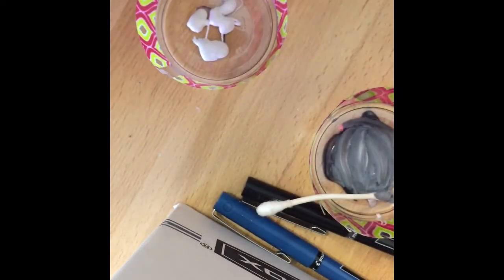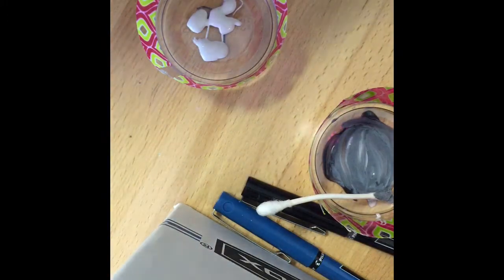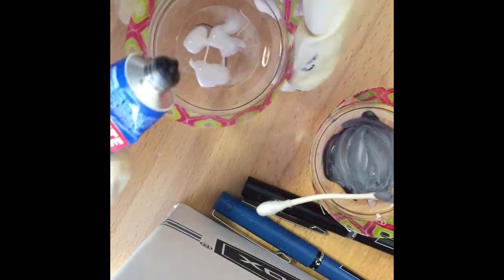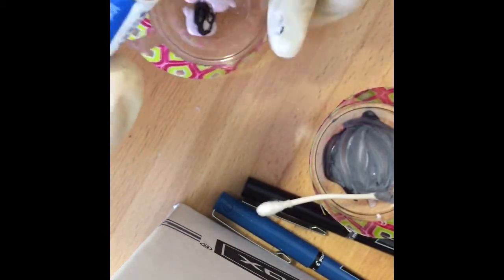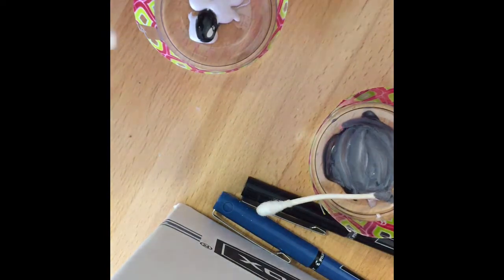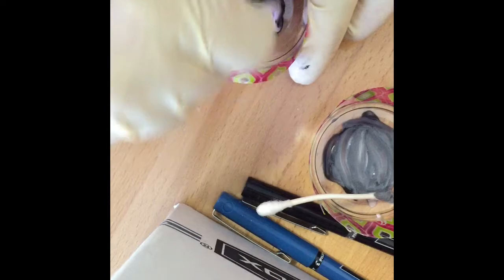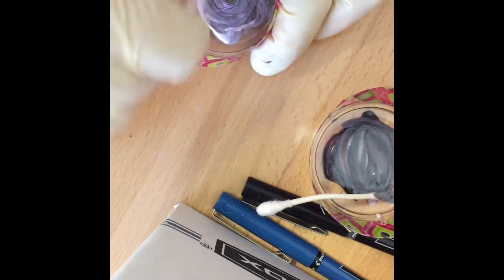Now, I'm not exactly showing the instructions, but the instructions do say you want to try and get whatever you can mixed within 5 minutes, because it starts setting after that. So I'm going to take one little. Sorry to put that little extra bit there, but looks like a little bit that would have been 2 parts resin almost. So I'm going to take my little Q-tip. Oh, this is going to have that nice little pink consistency of the hardener.